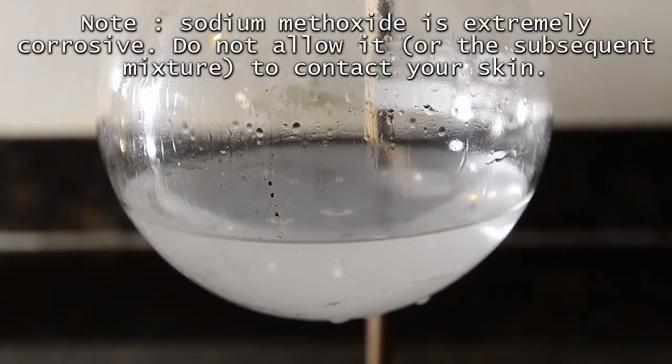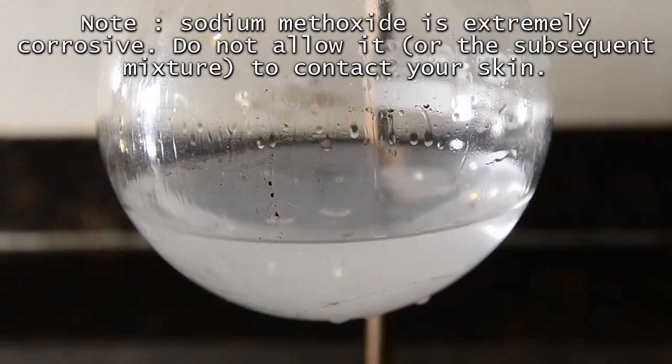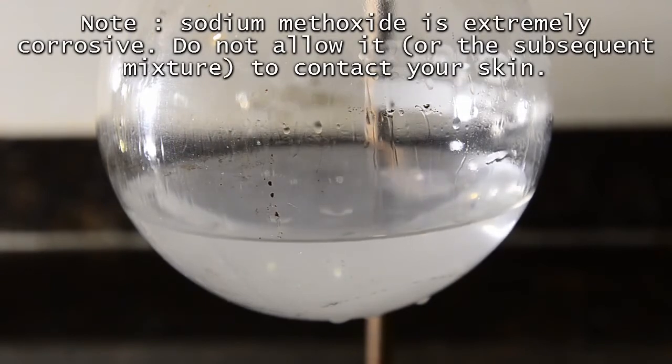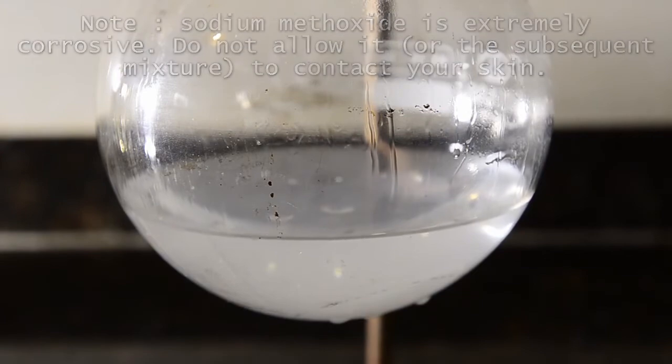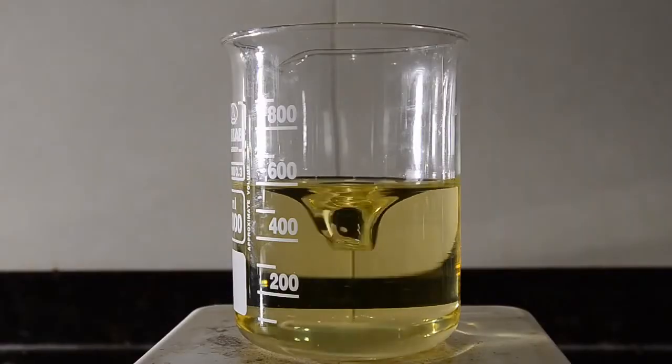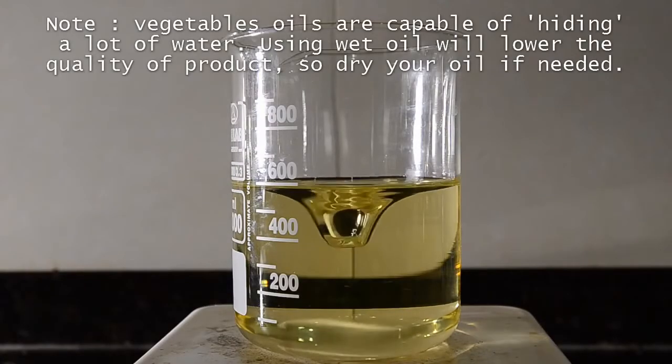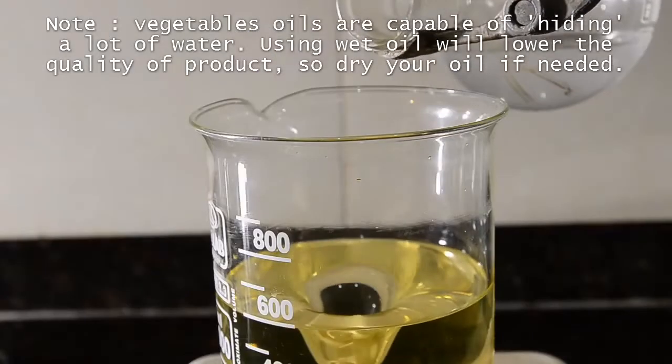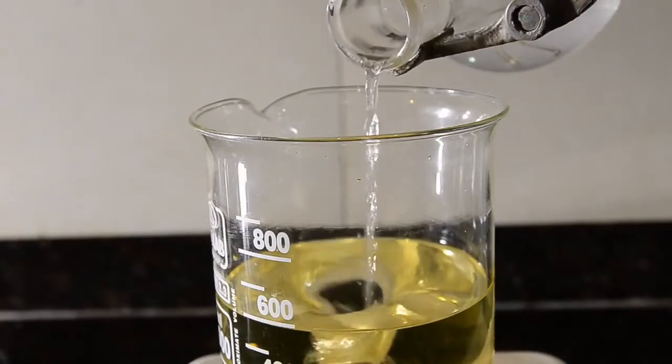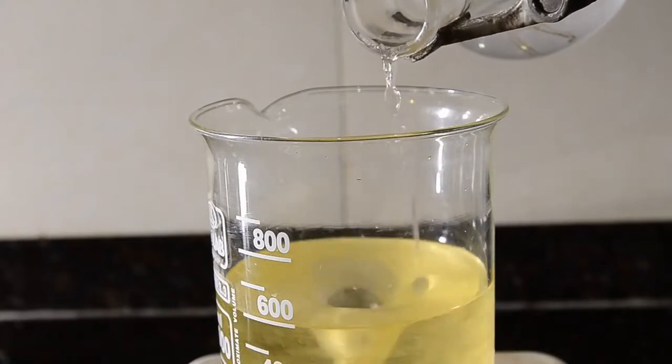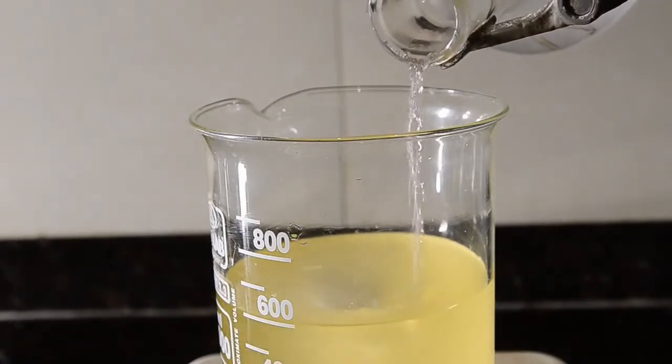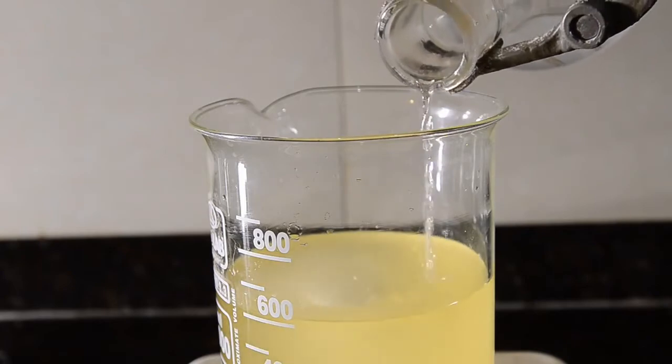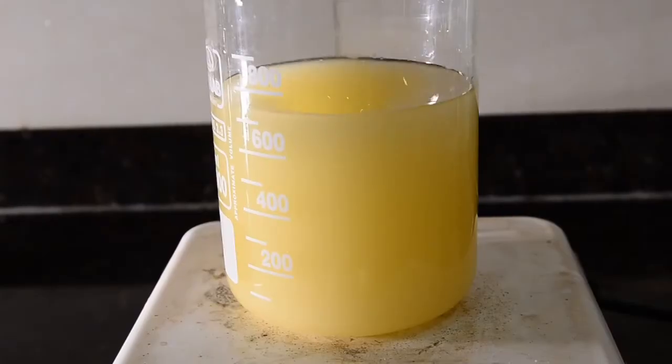A word of warning. This solution is extremely basic and you want to be very careful not to spill it or get it on your skin. Set up the beaker of oil with strong magnetic stirring and on a hot plate. Now add the hot sodium methoxide solution to the oil. Do this slowly so the mixture doesn't splash. Once it's all added you will have a cloudy looking mixture like this.